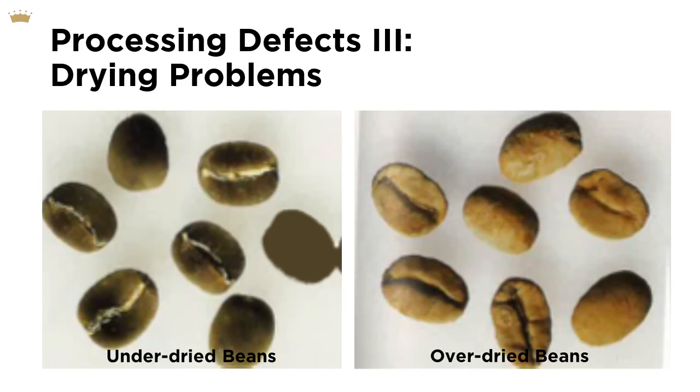So it's possible to spot some of this fungus visually, but some microbial damaged coffees remain latent until roasting, like the potato defect. If an infection is particularly bad, brownish spores might even appear on the surface of the seeds. And I've seen people use black lights to spot fungus damage, but black lights will also return false positives for things like pulpernicks and less consequential drying anomalies and a few other non-severe defects. So it's not a 100% reliable system.